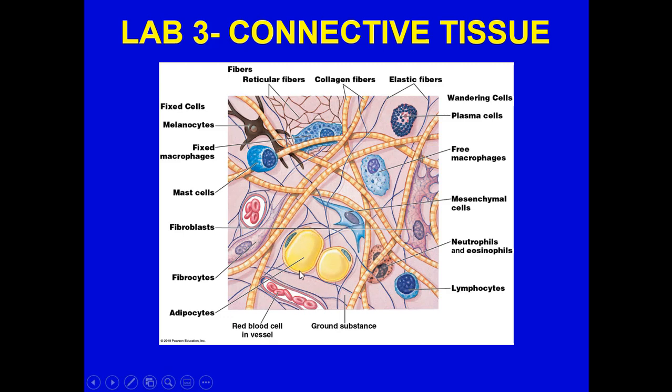Notice that the space in the adipocyte, most of it is used to contain lipids. One of the things you find when you do a slice and you see a microscopic slide of adipocytes is that because of the solutions that are basically making fat soluble, these cells look very empty and spacious because they've literally just washed out most of the lipids that are in here.